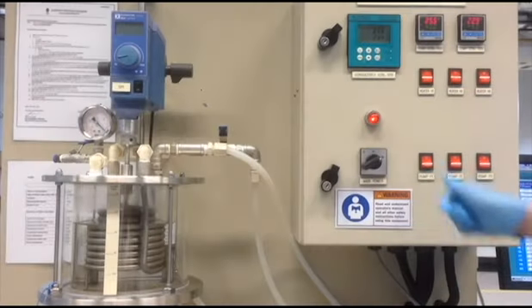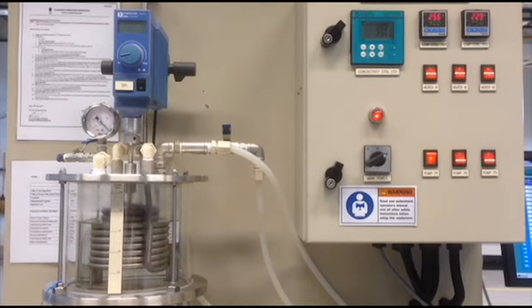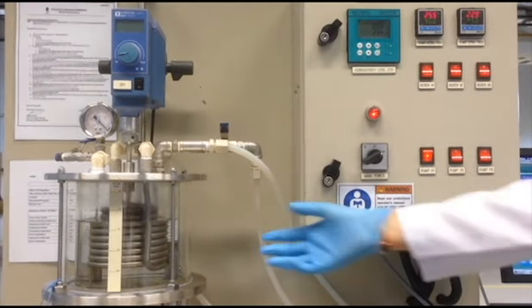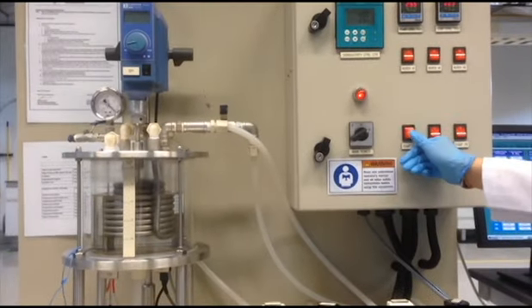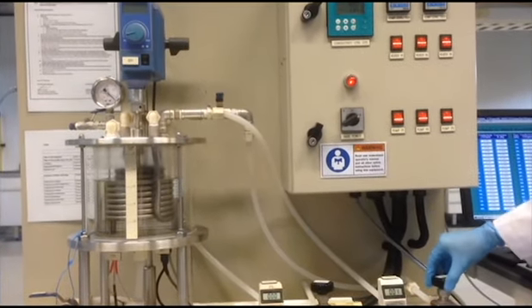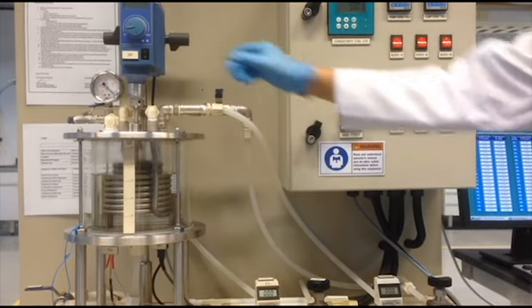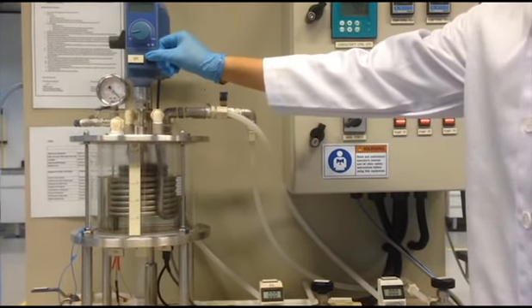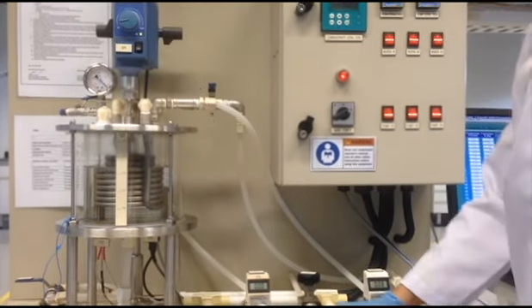For the next step, switch on pump 1 and start pumping 1 liter of 0.1 mole of sodium hydroxide into the reactor as quickly as possible. After that, stop pump 1 and close valve 1 simultaneously when the reaction volume reaches 2 liters. Switch on the stirrer and set the speed at about 200 RPM. Immediately start the timer.